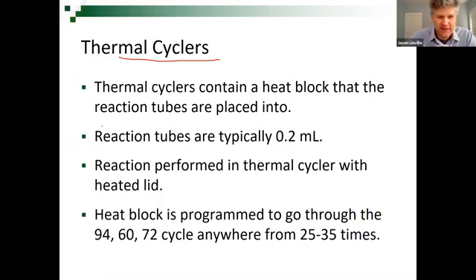This thing about the heated lid, this probably isn't really important, but I do want to mention, if you just threw a tube without a heated lid into the thermal cycler, you would heat up the reaction to 94, and when you cooled it down, you would get a lot of condensation, just water at the top of the tube, the cooler area of the tube, if it was exposed to air.